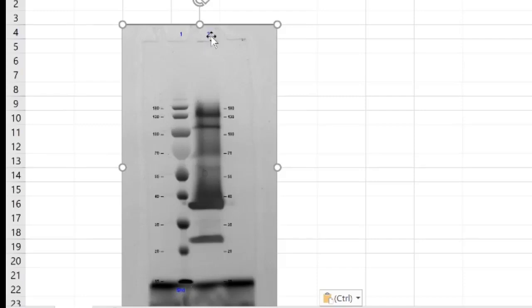The sample loaded in lane number 2 was the crude extract. It's not a purified protein, but if we stain with catechol or any other diphenolic compound, we specifically stain proteins that show polyphenol oxidase activity. Note that in a crude extract, you have many other molecules present.